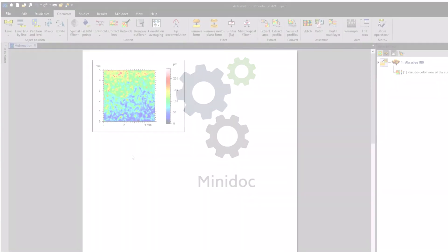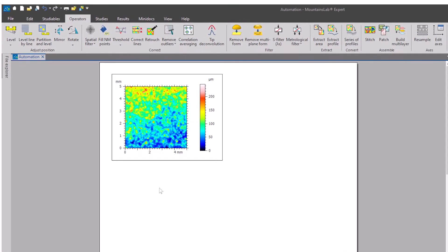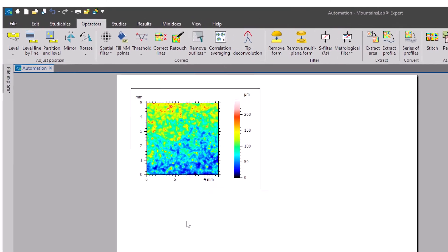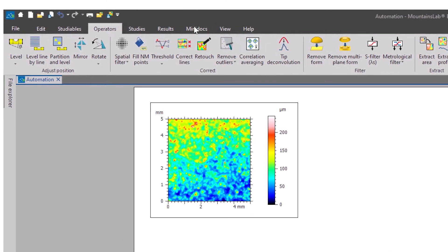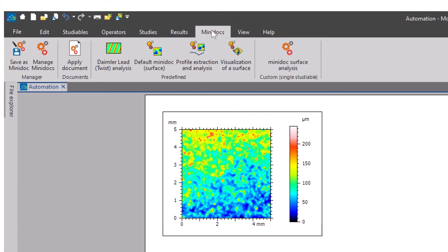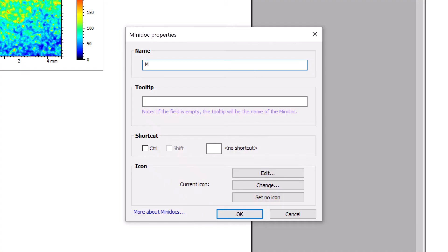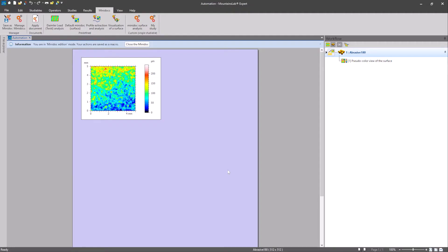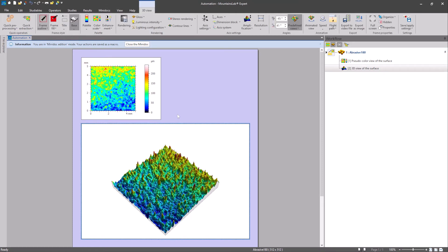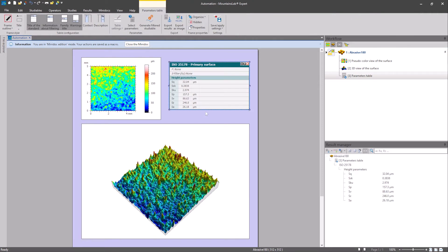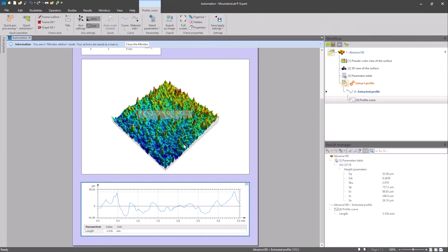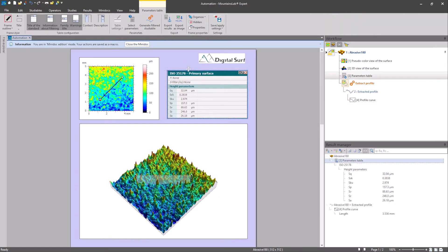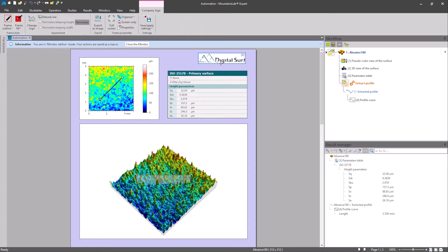To create your mini-doc, go to the mini-docs tab and click on Save as a mini-doc. Give your mini-doc a name, then simply save the actions you wish to reapply. In this case I'm going to apply a 3D view, generate the parameters table, extract the profile from my surface and create a document background with a company logo.